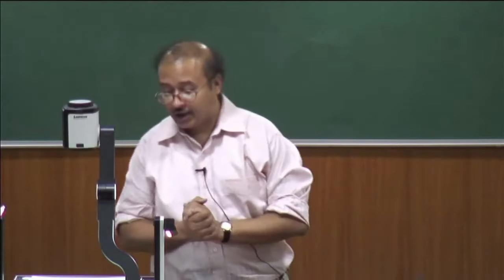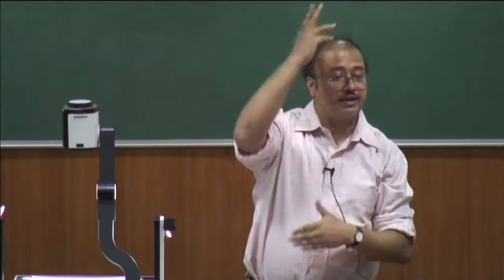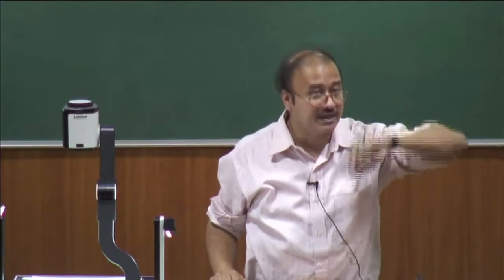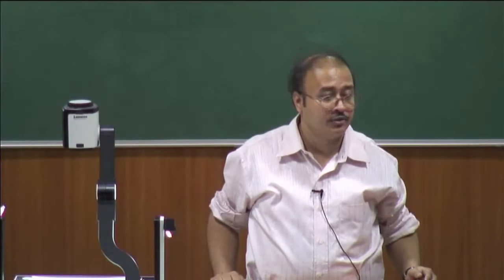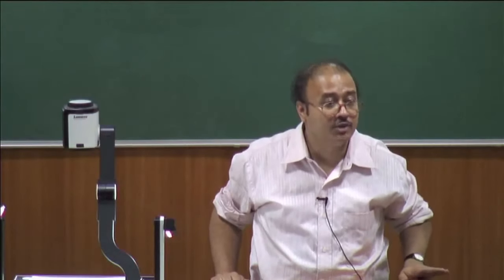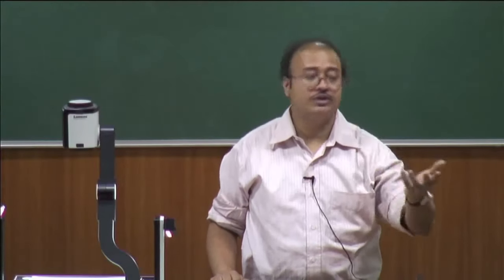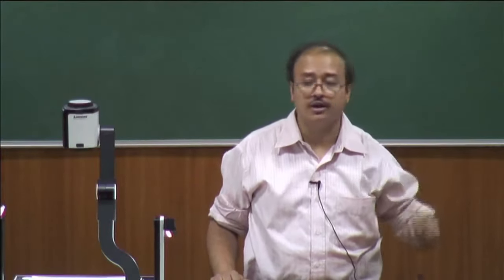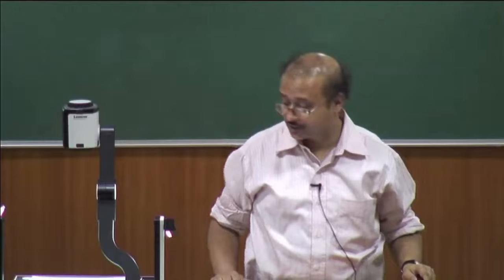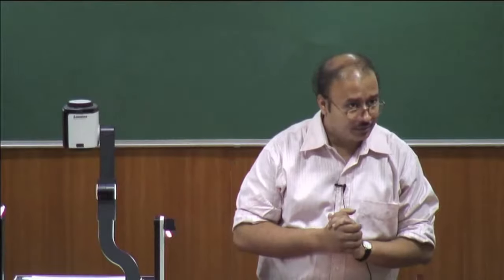Good. Okay, now, this was your time resolved. So, time resolved means you have excited a molecule, and then you are looking at its progress, that means its decay from the excited state to the ground state as a function of time, right. So, that is why there are time resolved spectrophotometers, which do this job routinely for you. You excite and then it comes down and you fit it to a certain functional form, and you extract your parameters, okay, tau and all these things. Now, we would not be discussing that at much length.